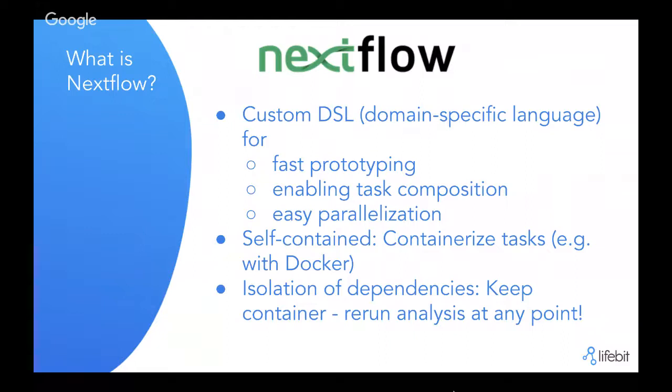Yeah, and then the third benefit is parallelization. Because you're specifying all of the inputs and outputs, Nextflow can model exactly what's needed and when, so it can execute these in the most efficient way possible. For example, with DeepVariant, there's the make examples process, which is the most computation intensive step, as we'll see later.